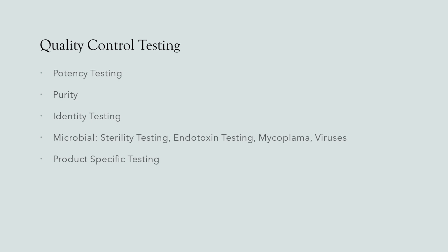But process analytical technologies is different, and that can be incorporated for continuous manufacturing, where you get real-time release testing, and that's a much more agile and efficient way of manufacturing your product, particularly when you're looking to scale up or produce more of your antibodies, and scaling up and scaling out might not necessarily be the route that you would go for.